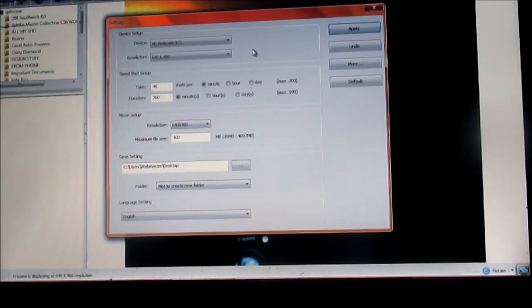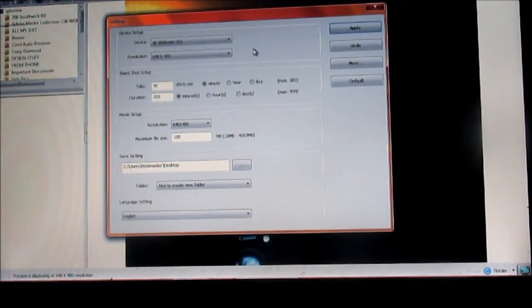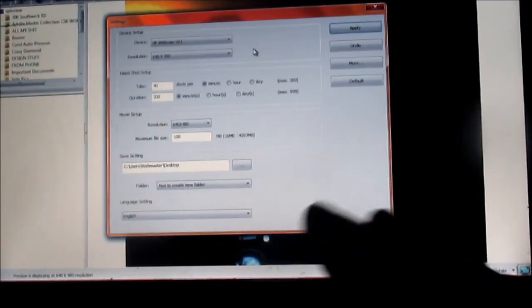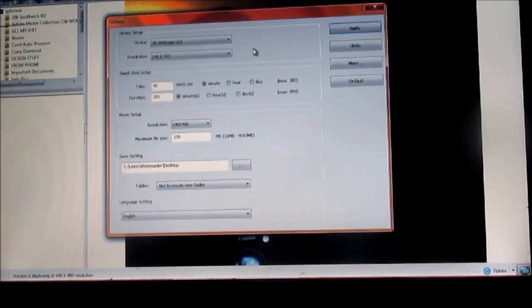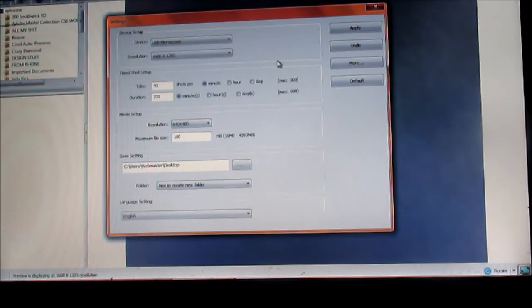All right, a couple of things I wanted to mention quickly — I was toying with this unit off camera. You have to go to the website to download the application and software for the device. It operates like a webcam so you don't really need the software, but it allows you to easily take pictures and video, so I went and downloaded it anyway. Long story short, the publisher on the software is unverified, so it's going to red-flag your computer. I isolated it, it ran fine — seems like there's nothing wrong with the software.